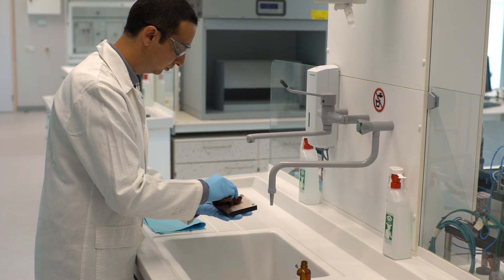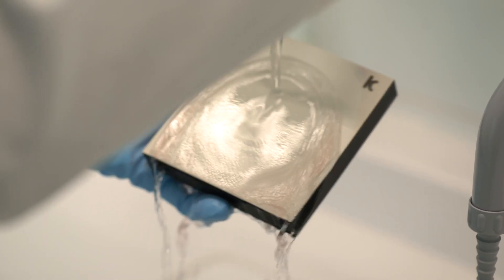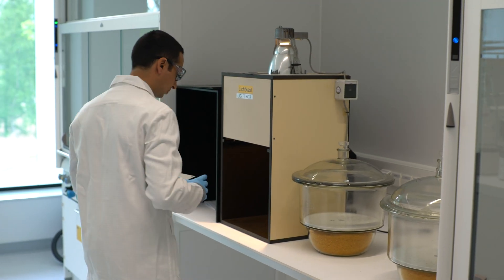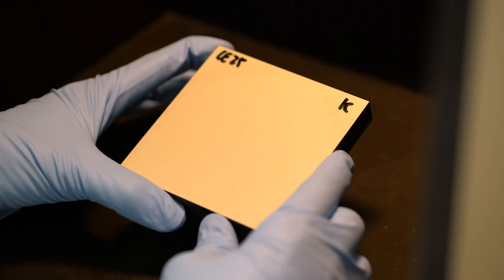The scratch resistance of a panel is expressed in a numerical class indicating the maximum load which does not show a continuous surface scratch.